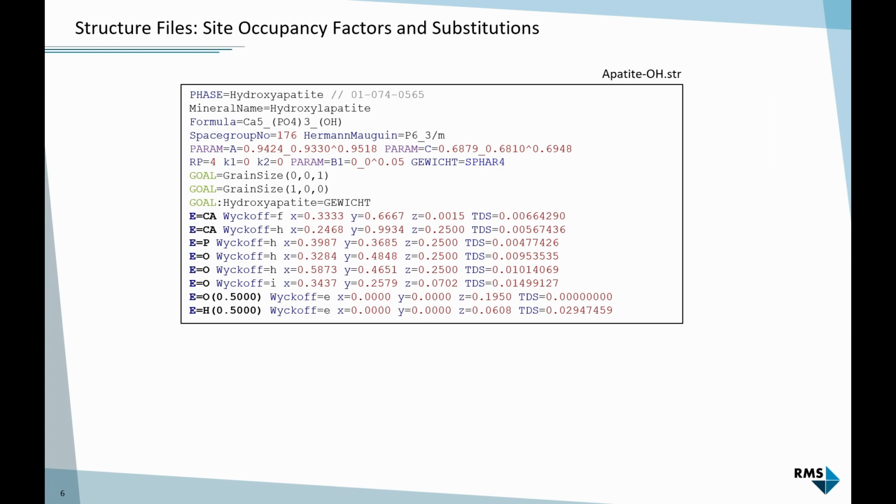So the next detail about structure files I want to discuss is site occupancy factors and substitutions. In this example of hydroxyapatite, we already see one specific feature.